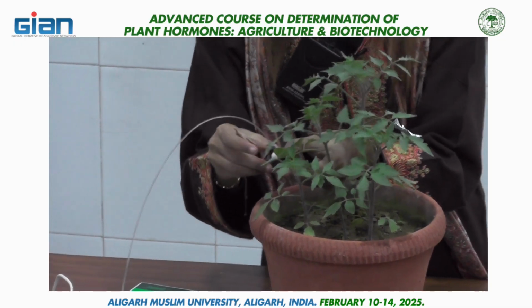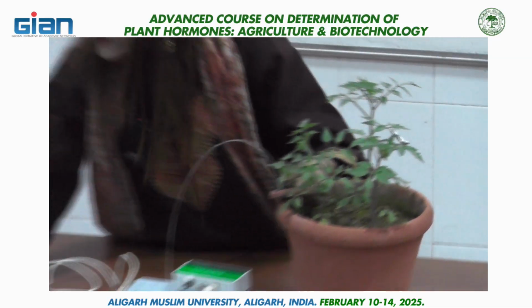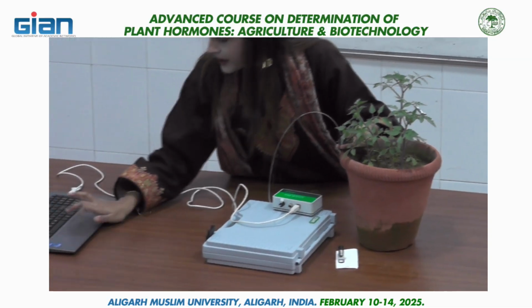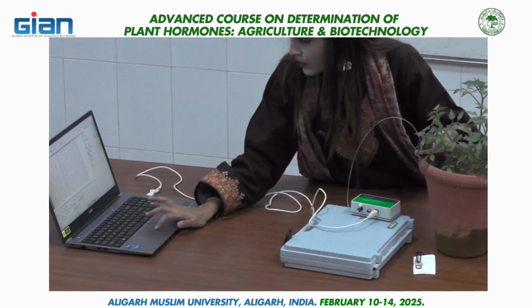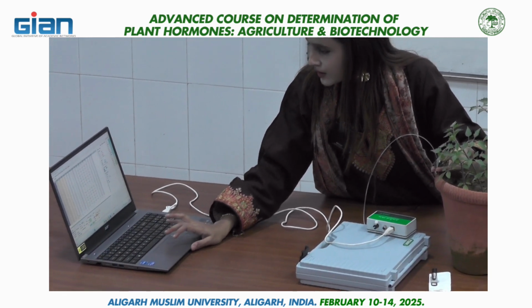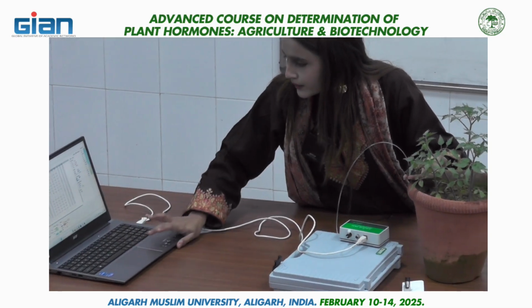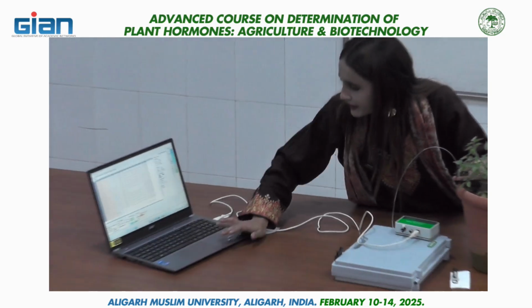It should be flat like this. Then we read our reading by clicking on set.